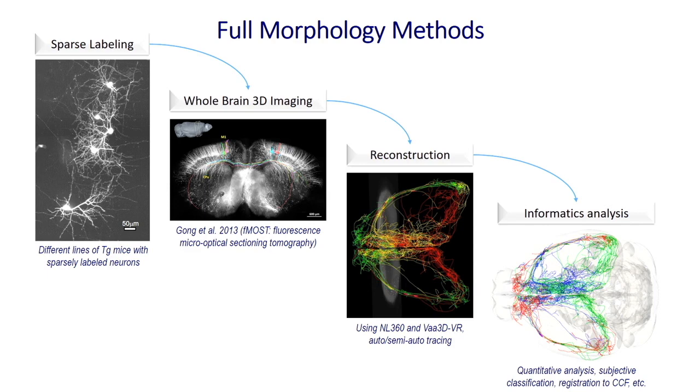In recent years, more and more studies have been reported on whole brain level single-cell neuron reconstruction. However, if you take a closer look, you will notice that most of the neurons are incomplete, largely missing the local branches of the axons. Because the initial branching was missing, some long projections are also missing.